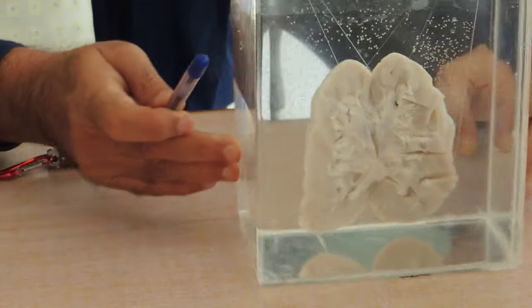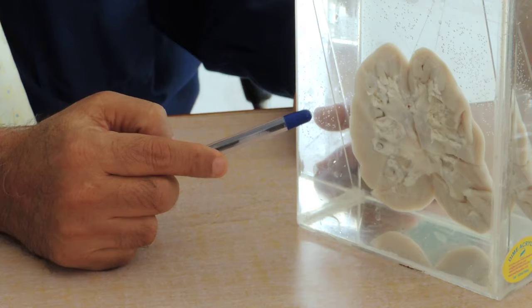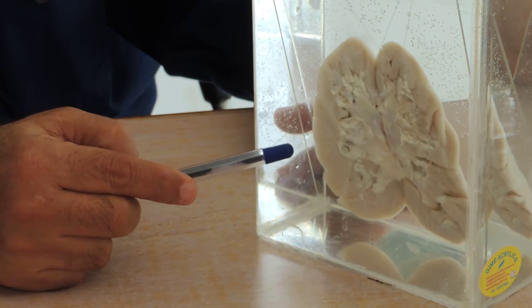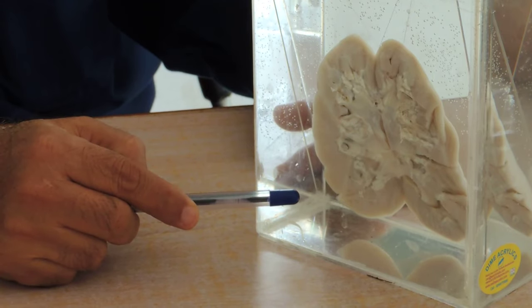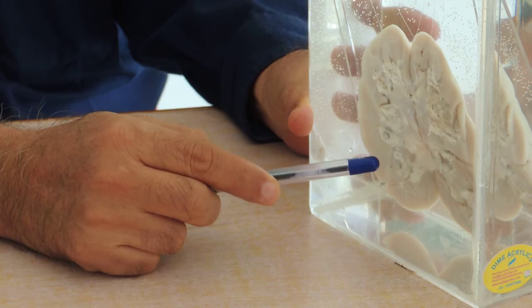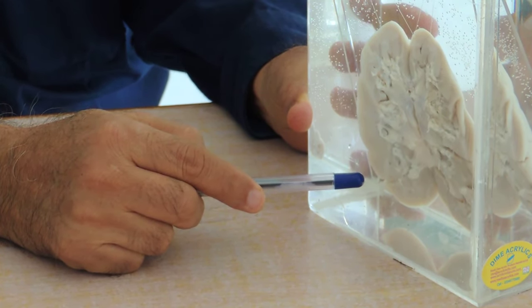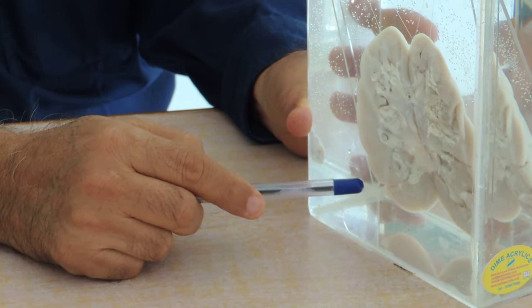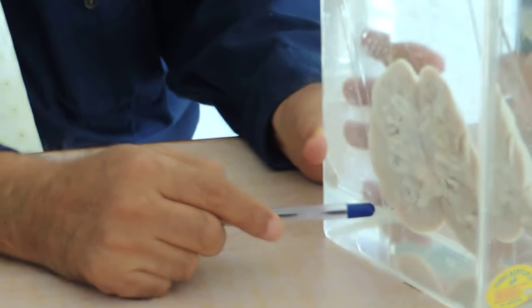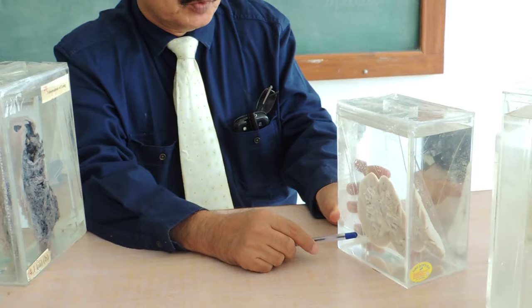Now on the inner aspect, that is the cut surface, the distinction between corticomedullary parts, or corticomedullary distinction, is lost. The inner surface is also pale and white, and there is a proportionate mild increase in the pelvic fat. The diagnosis of this case is large white kidney, and the differential diagnosis is amyloidosis of the kidney, cloudy change, and RPGN or rapidly progressive glomerulonephritis.